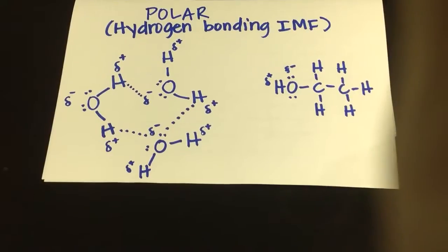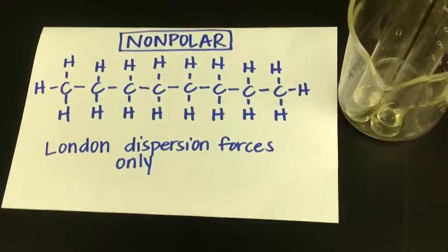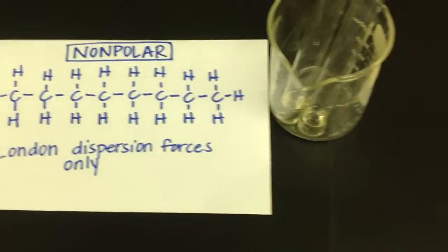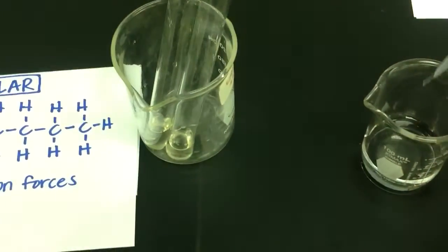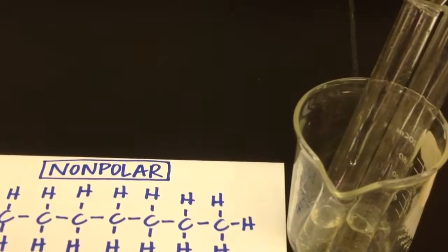So when I combine a polar solvent capable of hydrogen bonding with a non-polar solvent that is not capable of hydrogen bonding, I will see layers form. To demonstrate this, we've got some water we'll add to our non-polar solvent, and we'll also add our ethanol to our non-polar solvent. In both cases, we see the formation of layers.